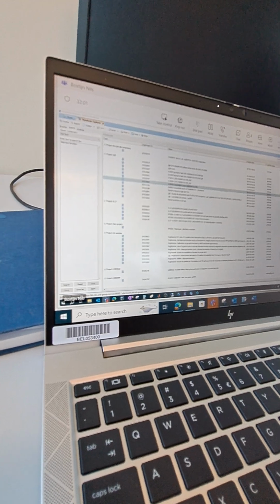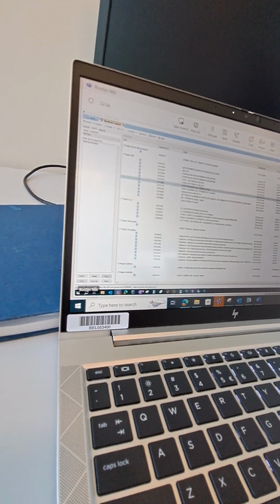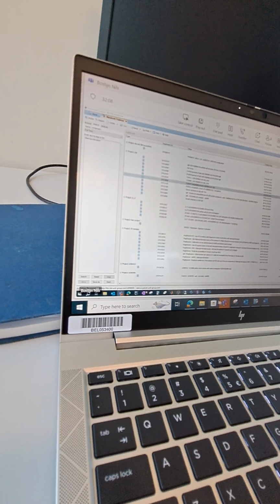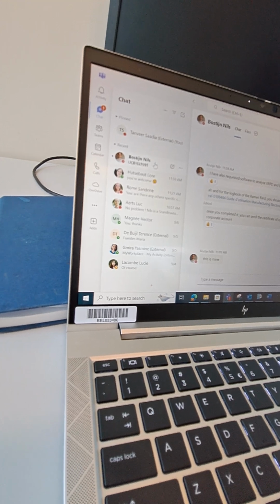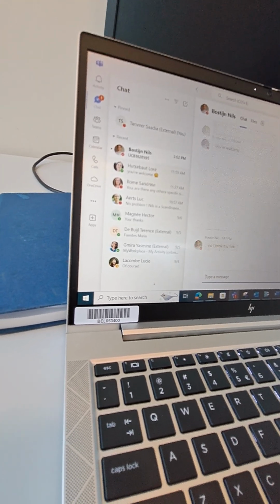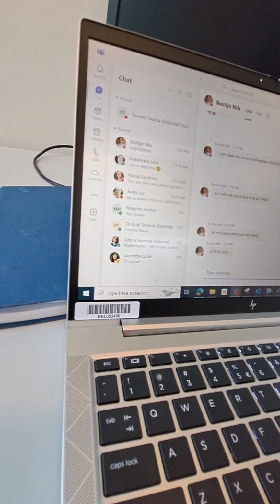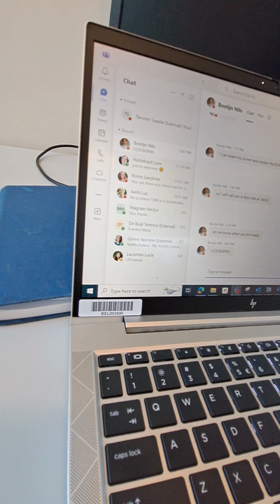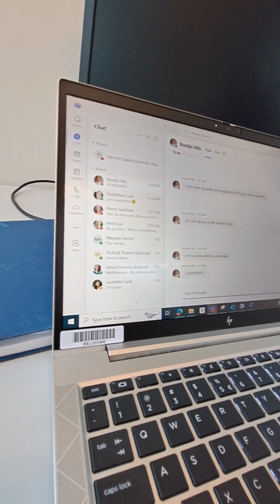So that one is covered by confidentiality because there's a patent on it. But all the rest, the things you can find in these ELNs, some of them are still in development, and so you should be careful with sharing data. You see the point.